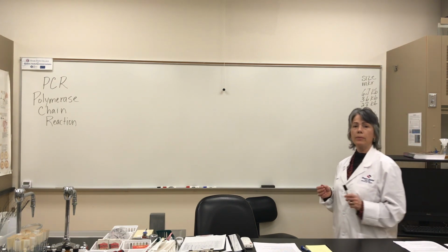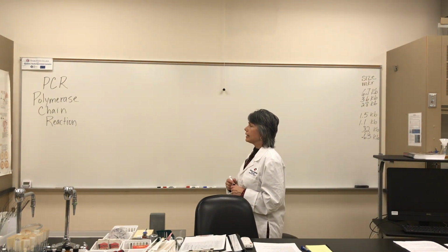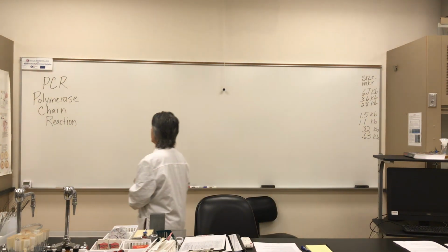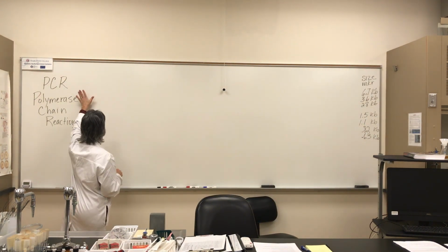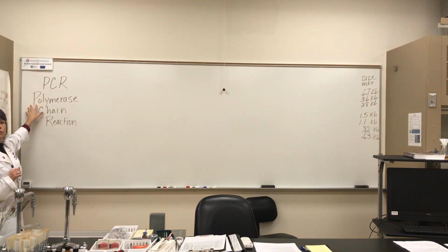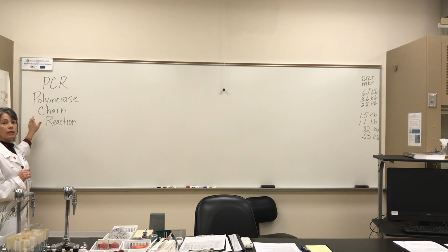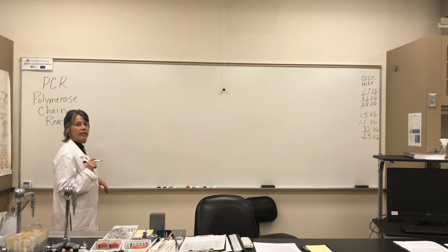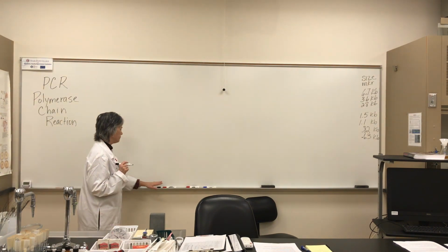I like to talk about PCR as kind of a magic wand. Because, and over here we've got, in case I forget to tell you, PCR stands for Polymerase Chain Reaction. You definitely want to know that for the practical. Now why do I talk about it as a magic wand?